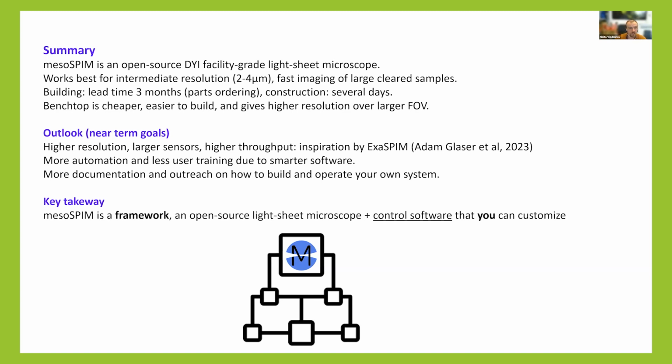And my key takeaway probably is that mesoSPIM is not a fixed microscope which you can just buy. It's a different mindset. It's a framework. You can modify it, you can upgrade it, you can disassemble it if you want to build something else. So it's really you own the system, and it's very modular and upgradable, both software and hardware. So it is a framework rather than just a fixed setup.